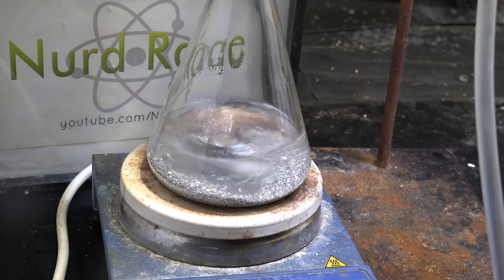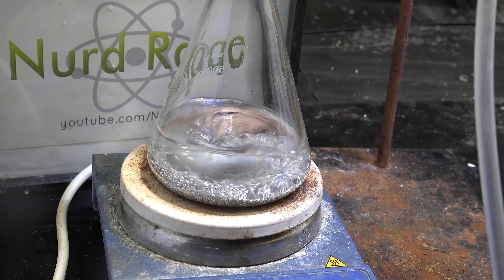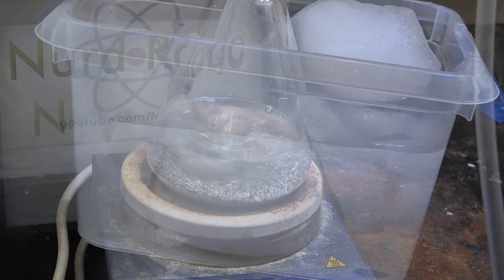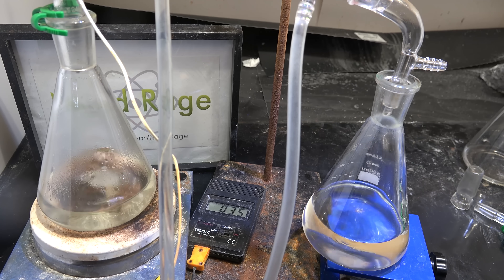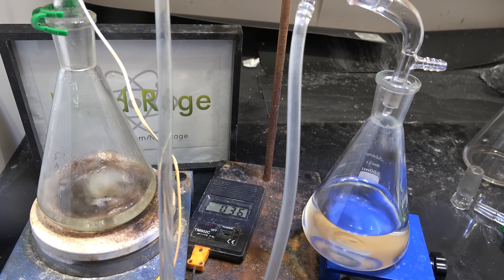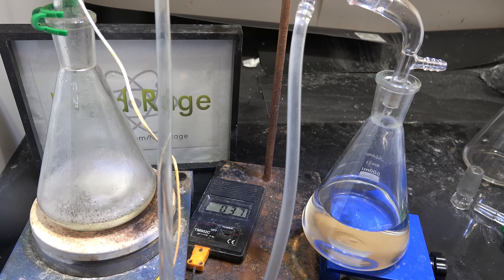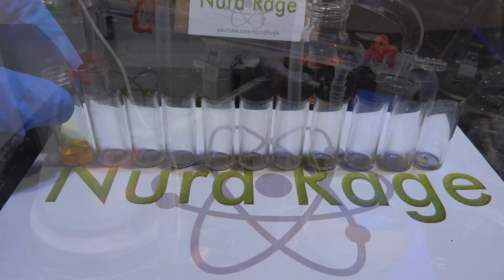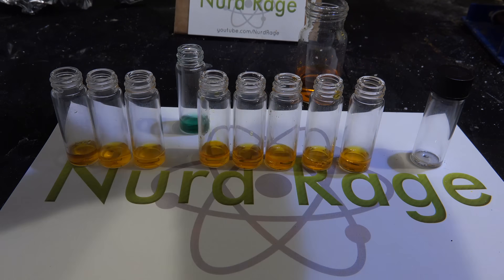Greetings fellow nerds. In a previous video I made various tertiary alcohols by the Grignard reaction. I purified them with a combination of acid washings, distillations, desiccant dryings, and fractional distillations. But if you go too fast or don't pay close enough attention to the temperature, you can still end up with impure products. So to get some idea of the purity, I'm going to do some very basic reactivity testing with my alcohols.